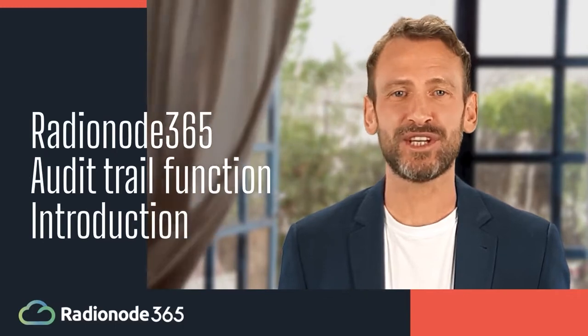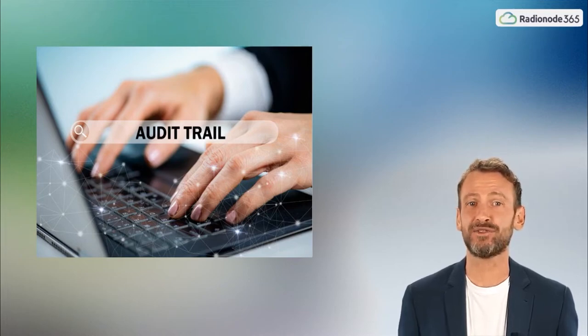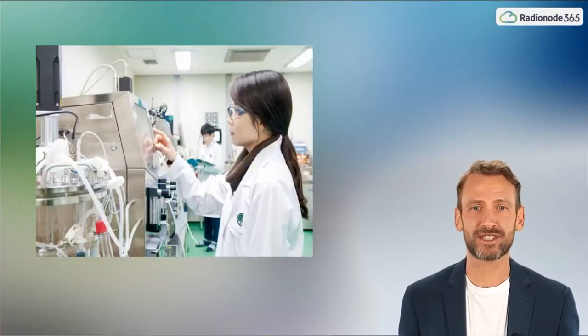This time, we will introduce the Audit Trail function. There are three main functions in the Audit Trail menu: User Access History List, System Notification History, and Quick Report Sending History. In particular, User Access History List complies with Title 21 CFR Part 11, a federal regulation of the U.S. Food and Drug Administration.